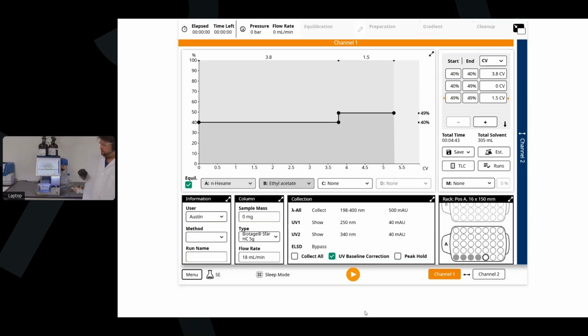Over on the left-hand side, which you can't see, is our UV flow cell. That is in tandem with a PDA detector that can scan wavelengths anywhere from the low UV nanometer range, 198, all the way up into our visible spectrum up to 810 nanometers. So it gives you a plethora range of access to be able to see your molecules and also never miss a molecule.